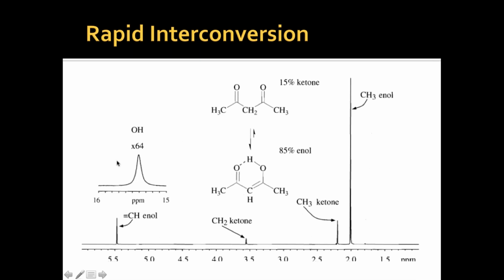See, this molecule shows you this. You can see methyl groups. Where's the CH2 of the ketone here? You see another methyl. You see another methyl. See them. So it's a mix of NMR, right? It's a mix of NMR. It doesn't make any sense if you have this NMR all belonging to one.